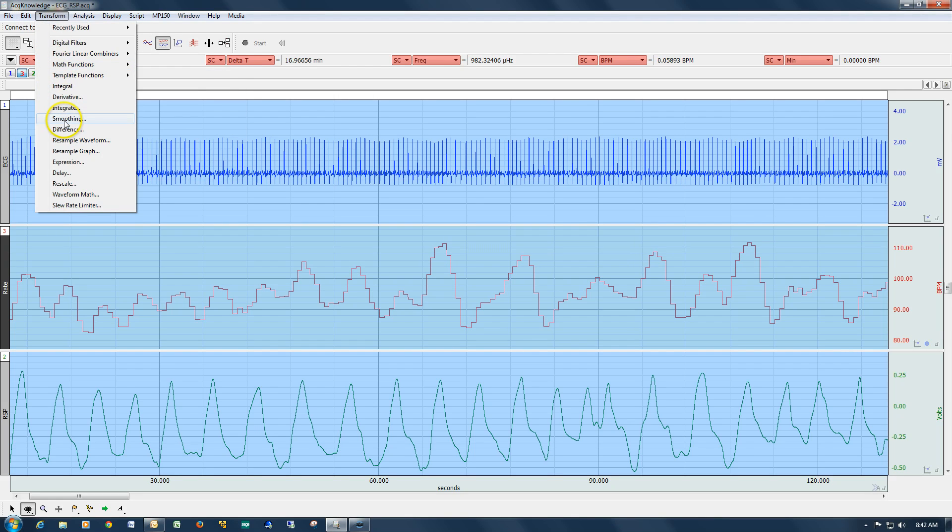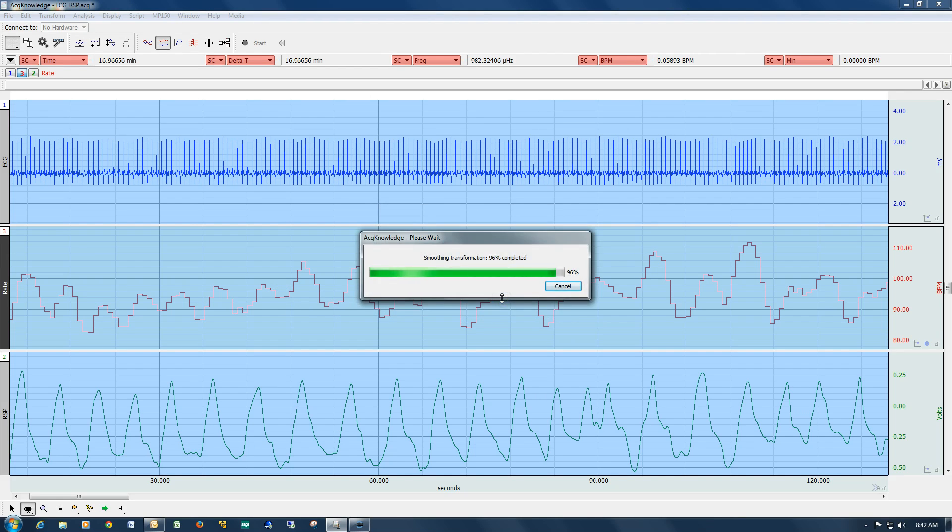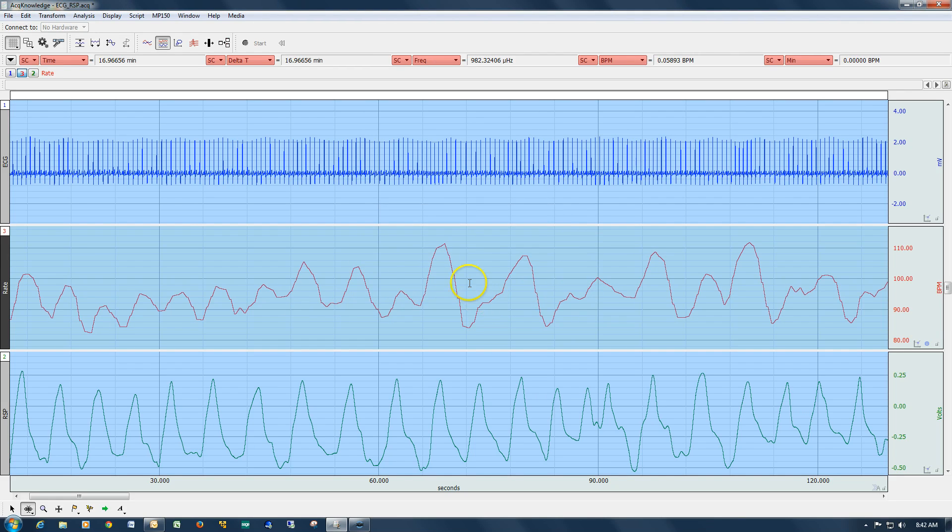So if we go again, try 500, and now we've smoothed it out.